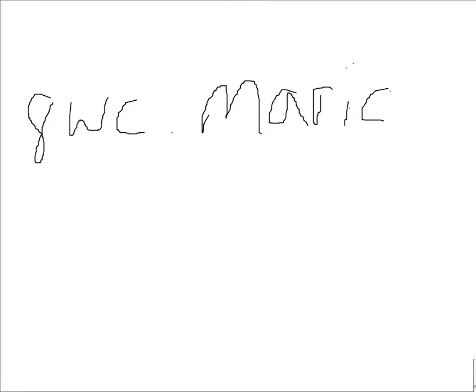So I think this will be good. We've given you some appreciation, hopefully, at this point for answering yes/no questions, but at some point you guys got to learn by doing. So we'll just look at some slides. I'll ask you the questions you should be asking yourself to get here, and then you'll see how this kind of flowchart will work.